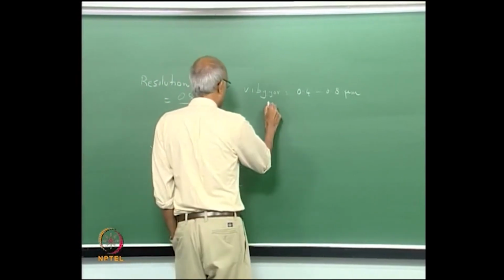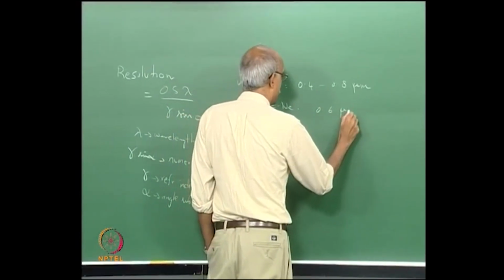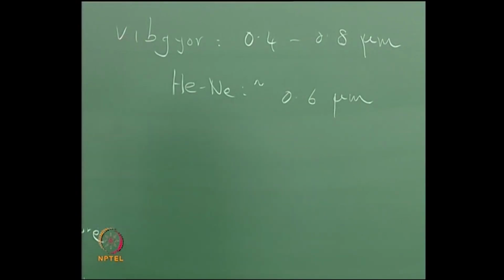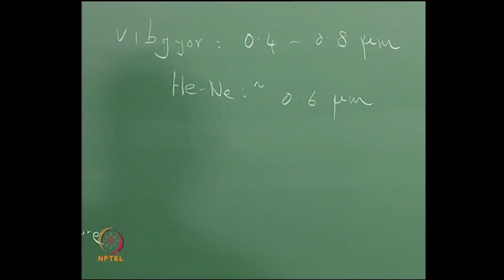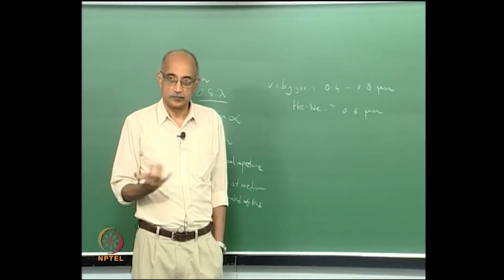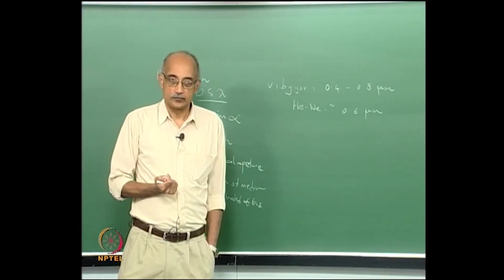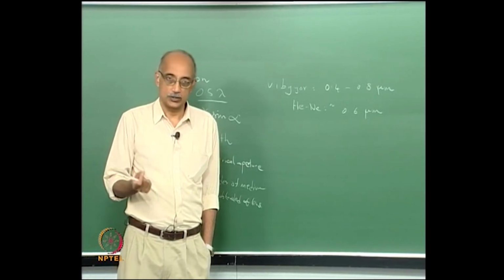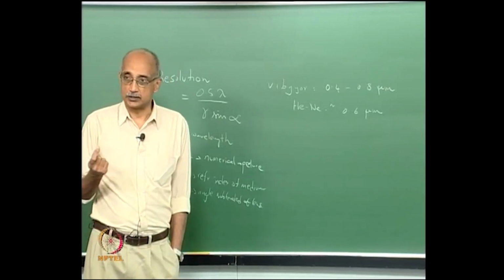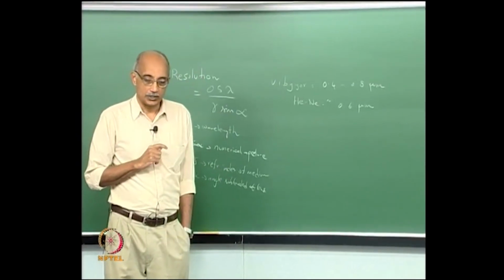Lasers, for example, a helium neon laser, have a wavelength that is sort of in the middle of this wavelength range for visible light. So, again, when you look at this, there is not a lot of room there for manipulation, and so the way that optical microscopes are now improving that resolution is really by playing around with the optics more than anything else. There is not a whole lot you can gain by trying to play with these parameters.